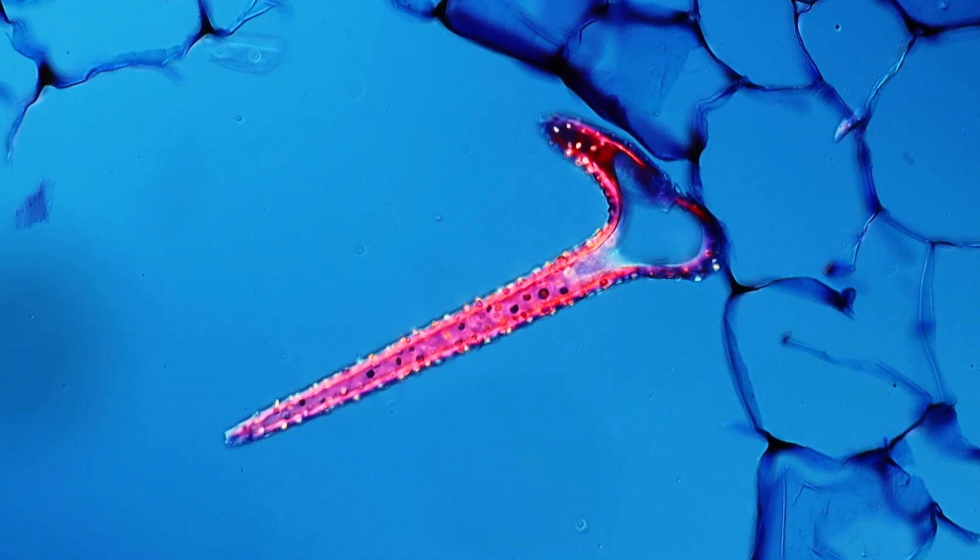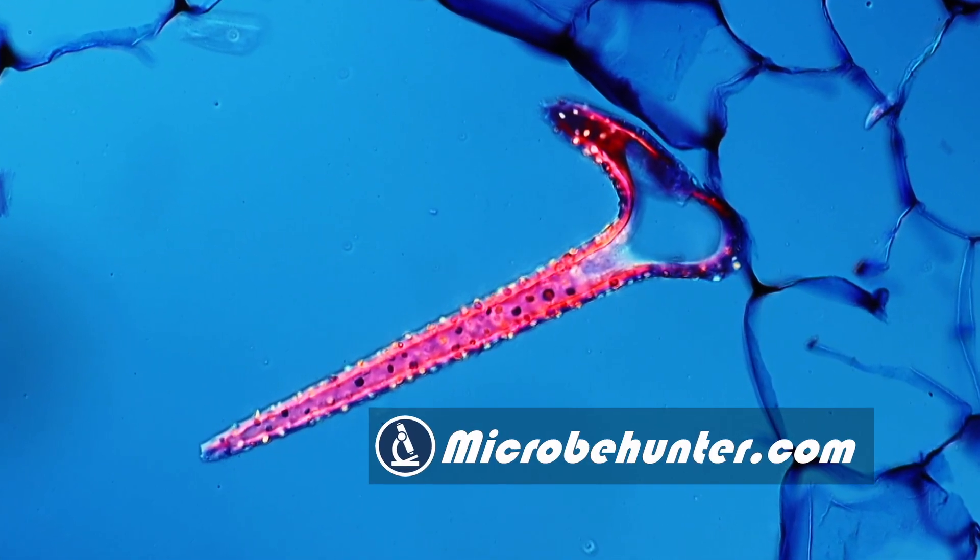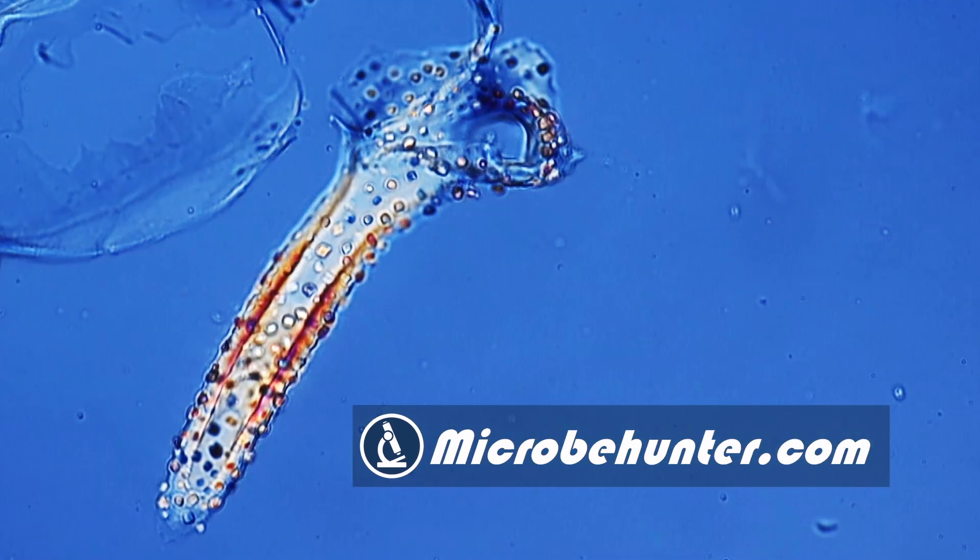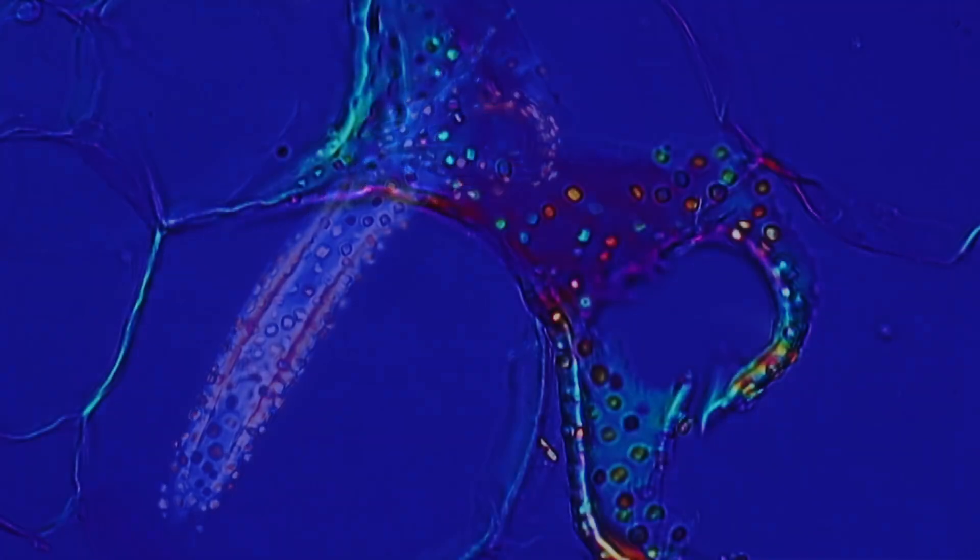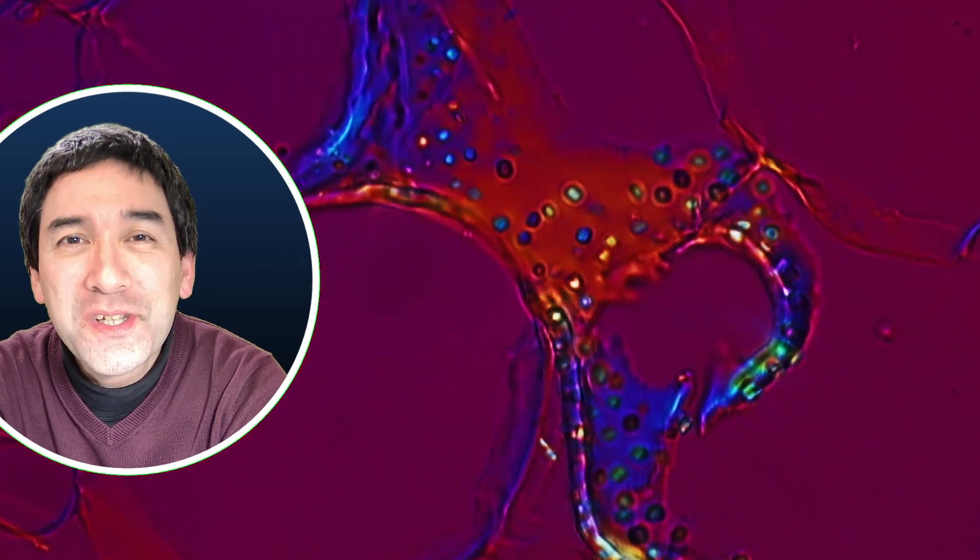Hi, hello and welcome again. Microbe Hunter here, and one of the things that I really like about hobby microscopy, amateur microscopy, is that we're able to see the beauty of nature. Today I would like to show you again a few very beautiful specimens.